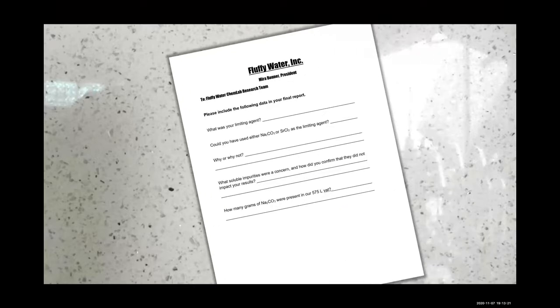Here's the report from our supervisor. What was your limiting agent? Well, we chose to use sodium carbonate as the limiting reactant. Could you have used either sodium carbonate or strontium chloride as a limiting agent? No, we couldn't. So, in explaining to her why, in order to determine the amount of sodium carbonate present in the solution before the reaction, sodium carbonate has to be the limiting reactant.